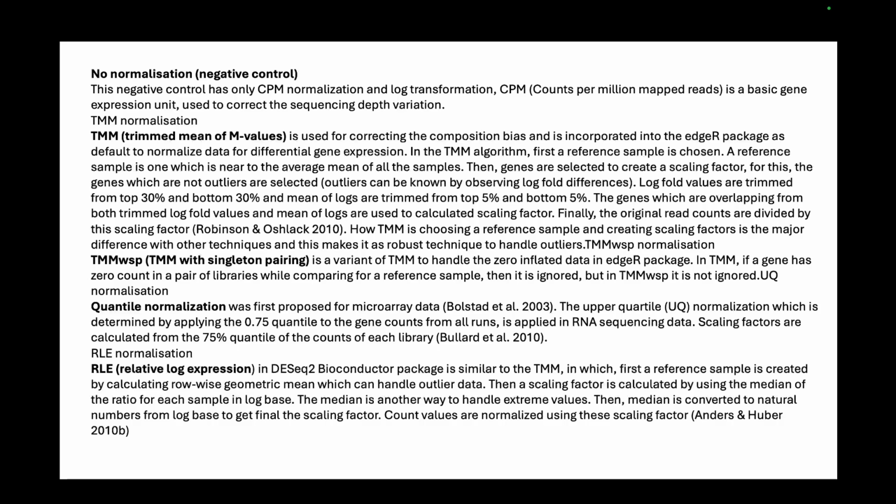So these are the different types of techniques that are used for in between sample or intersample normalization. And within sample normalization, we use methods like RPKM, FPKM, CPM, or TPM, whatever it is.